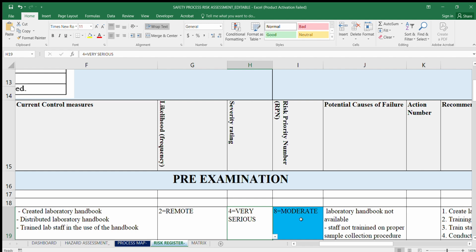So at this point, what we can say is that this risk is not high, and not very high, but it's also not low. Mostly what we want is for our risk to be falling in the low. At least that way we would say this risk is acceptable. But the acceptability of the risk will highly depend on, or be guided by, what you defined as a facility.